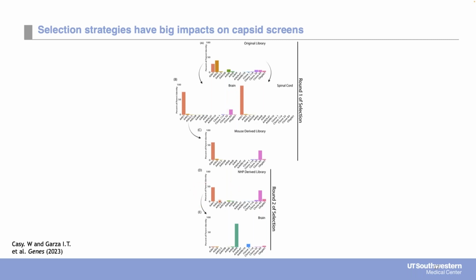But when we actually extracted out of nuclei and increased that stringency for capsids that successfully traffic to the nucleus, what we found is that we start selecting for capsids that seem to be functionally more relevant, such as capsids that resembled closer to AAV9, or even this clone right here, engineered virus, or clone 83. And this was the information that we gathered from the mice.